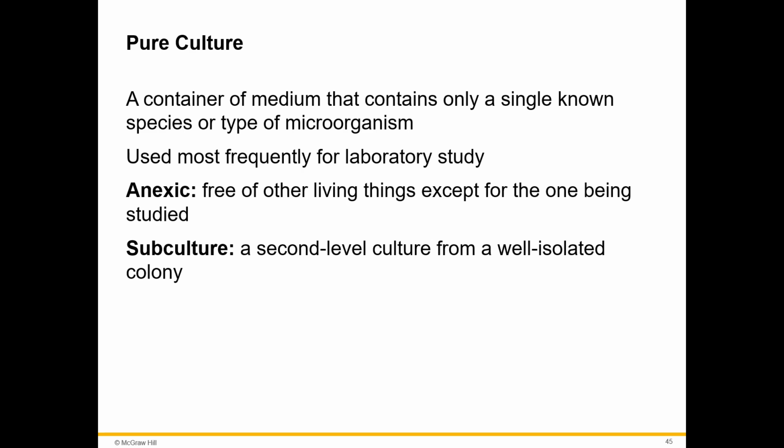Now, that pure culture sometimes comes lyophilized or freeze dried. Sometimes it comes on a slant, so it's a living organism, but it's been isolated from the original source, so that culture is a pure culture that's coming directly from a source. Well, from there, our lab tech will then subculture it.